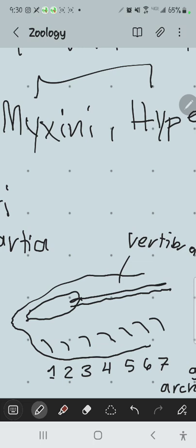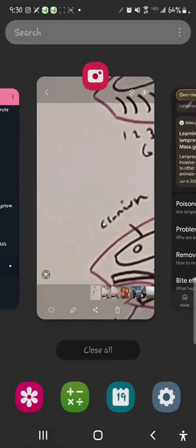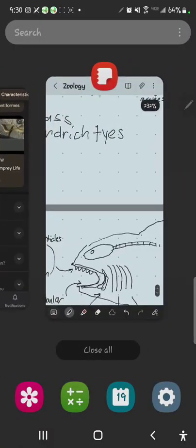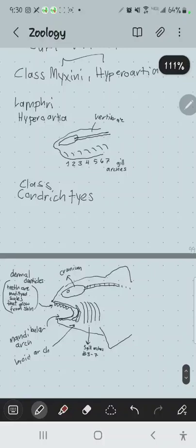They're not attached. And you've probably seen, like Shark Week on Discovery Channel, when they show a great white shark feeding, their jaws shoot out of their mouth or push out of their mouth. That's because the jaws are not physically attached to the cranium. It's just by a ligament. So they can move their jaws separately from the cranium. But essentially, jaws were a modified gill. And this is a really cool example of homology where we have exaptation, a new use for an older structure. A respiratory structure has been turned into a chewing jaw. And we're going to see it go further from that. Okay?